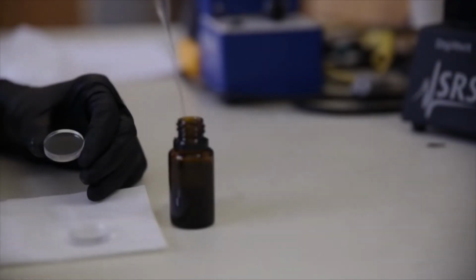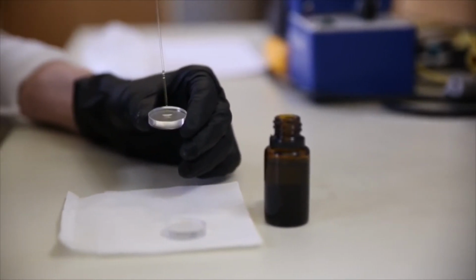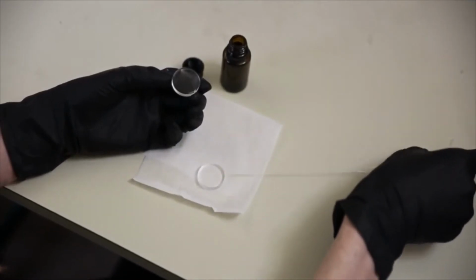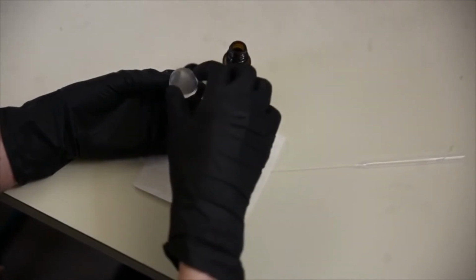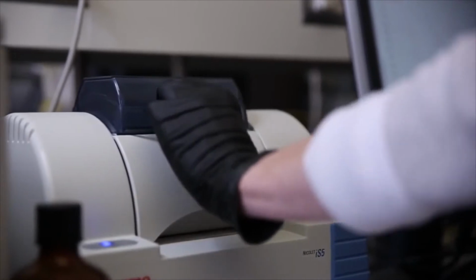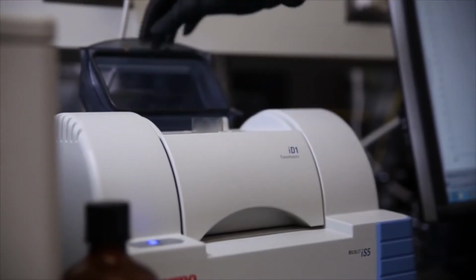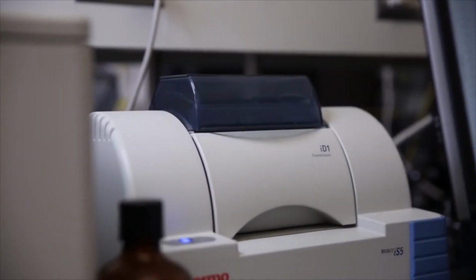FTIR is a quality control test used to identify the structural components that make up the constituents within an essential oil. A sample of essential oil is placed inside a specialized machine, and an infrared light is passed through the sample.